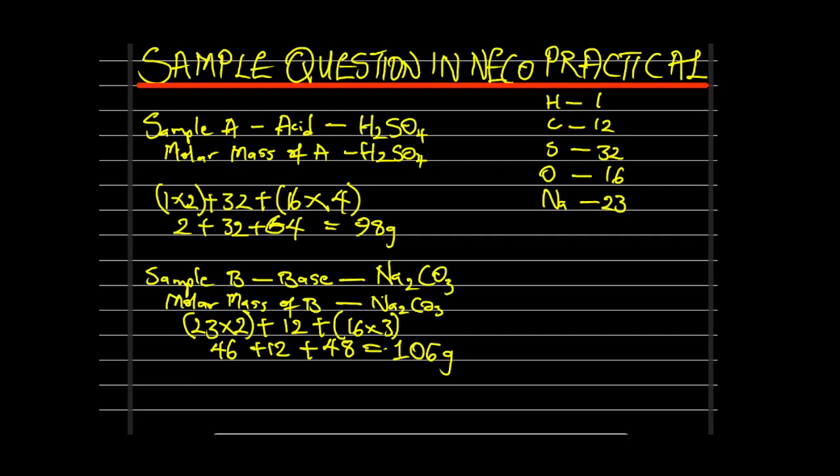You could also be asked to give the equation for the reaction. The equation for the reaction is going to look like this. Since it is a reaction between H2SO4 and sodium trioxocarbonate, we'll have it to look like this.